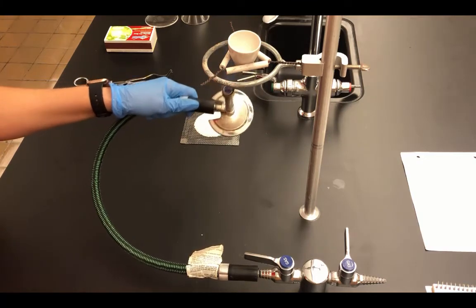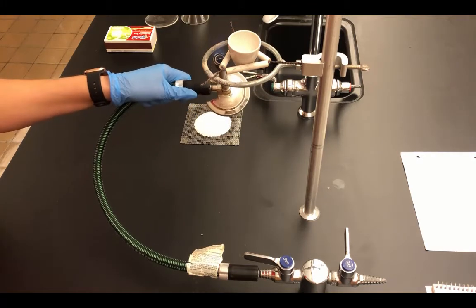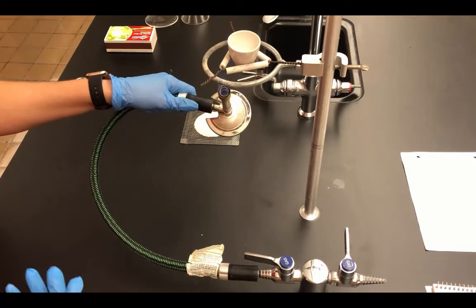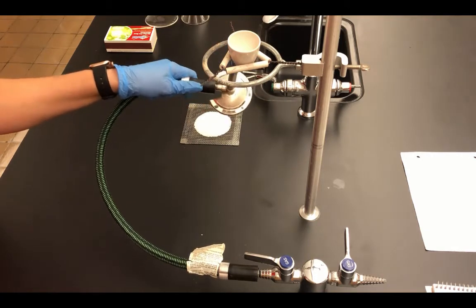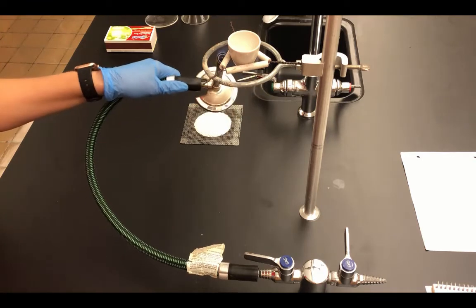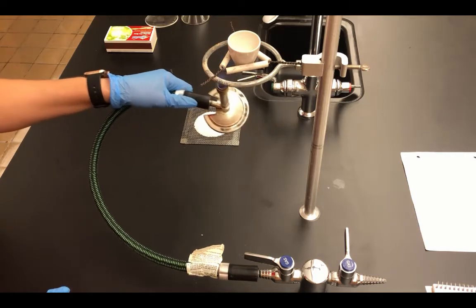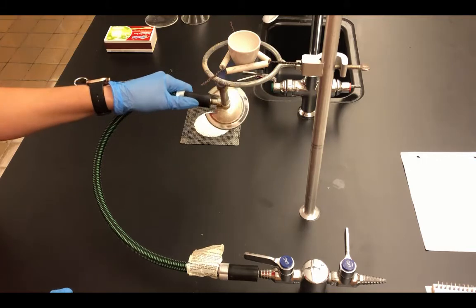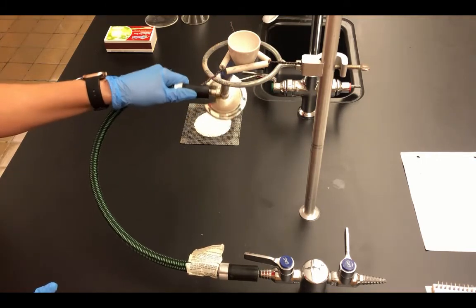And the reason we want the mass to stay constant is because, like I had said before, metal carbonates from group 1 are hygroscopic. Those words are synonymous. That means that they absorb water from the air. So by heating this until the mass stays constant, we ensure that the crucible and the substance inside the crucible is anhydrous. So there is no water in the substance or the crucible when we go ahead and complete the reactions.